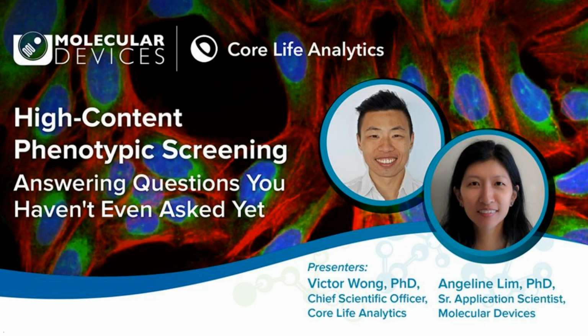Yeah, I think. Go ahead. Okay, I think it's mostly on the wet lab stuff and on the robotic pipetting and image analysis stuff. That's the majority of the time that it takes, especially on the bench and wet lab stuff. That's to my knowledge the most time-intensive tasks that need to be done to get through the whole workflow from the beginning to the end.